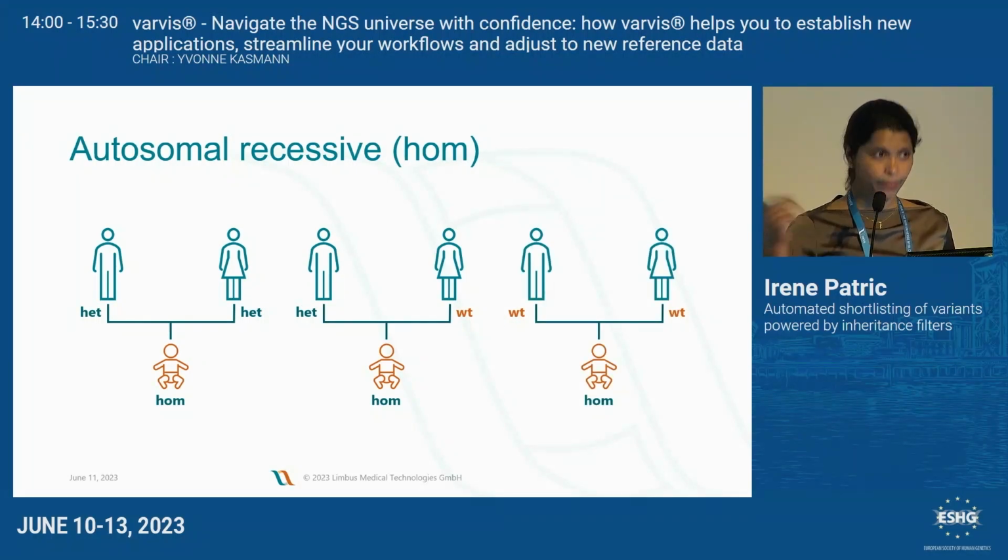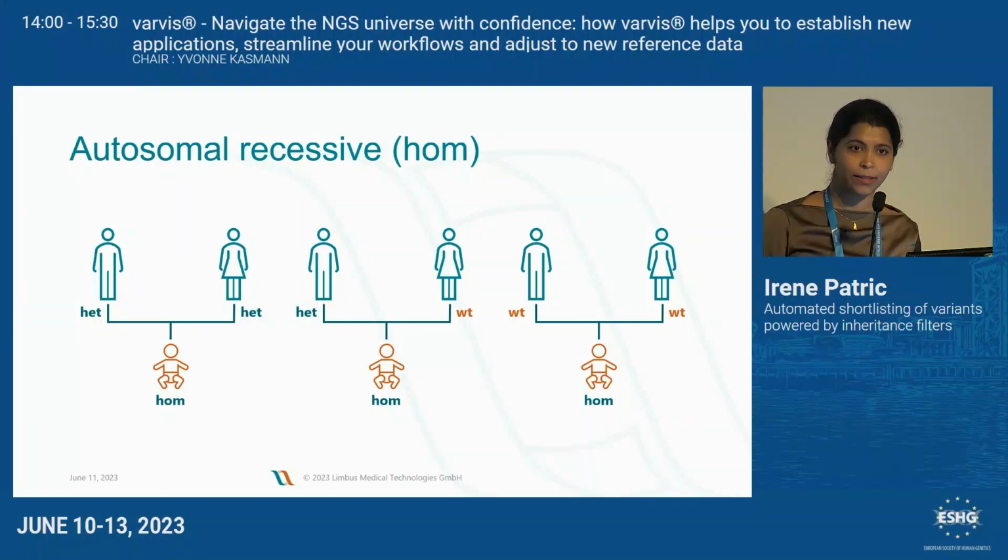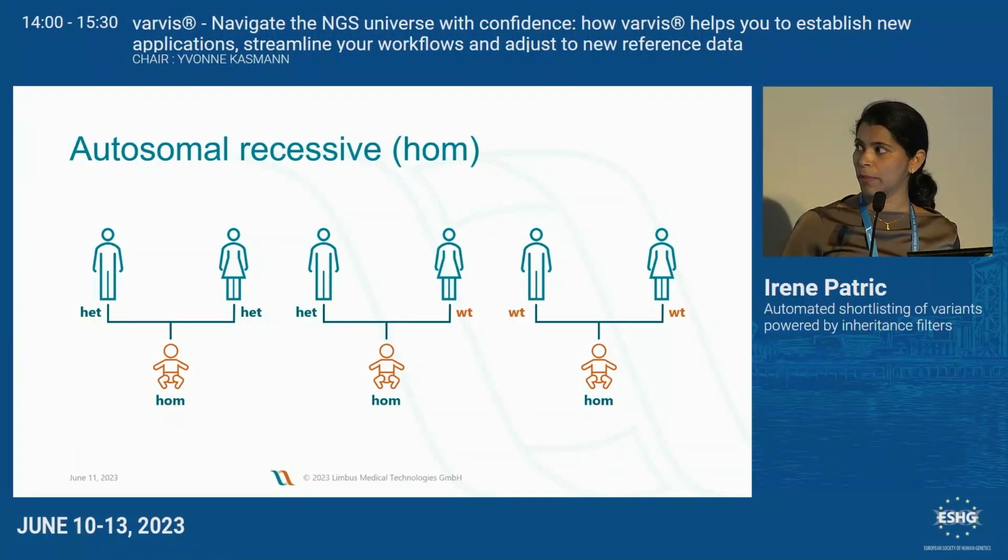Or this could also be the scenario like in the paper where homozygous de novo variants were detected. Now, the mechanism underlying could be different, but in spite of that, we have seen this reported in some cases, and it's important that these are being detected.